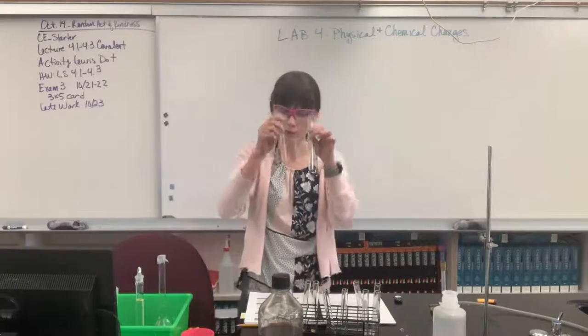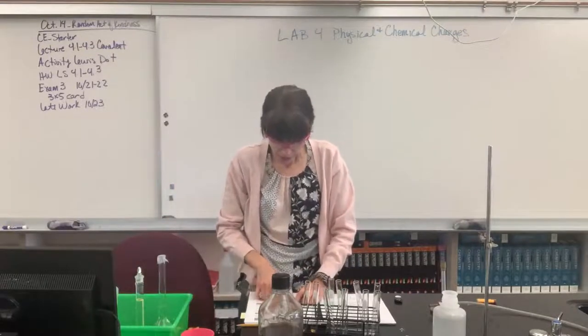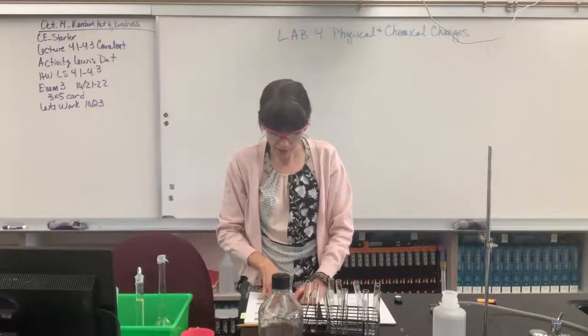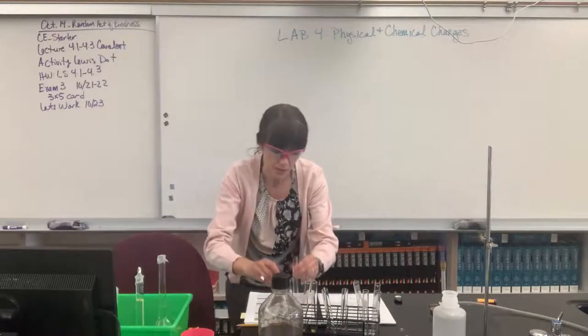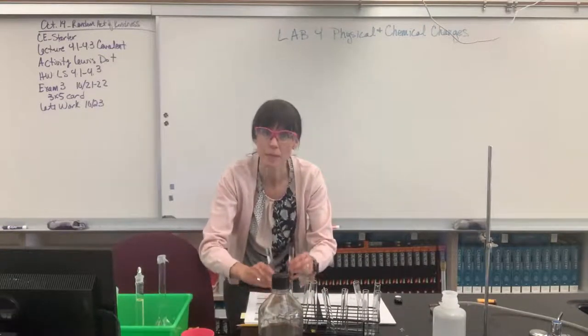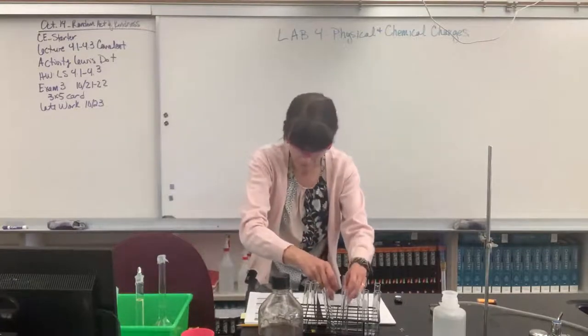I weighed out 0.1 grams and put those in 2 different test tubes. It says tap the test tubes on the bench top so that sample clinging to the sides can fall to the bottom. I did have a little bit cling to the sides, so I'm just tapping. Okay, looks like most of it went to the bottom there.